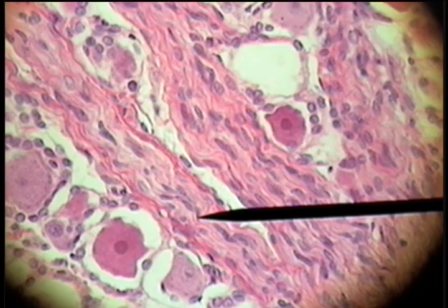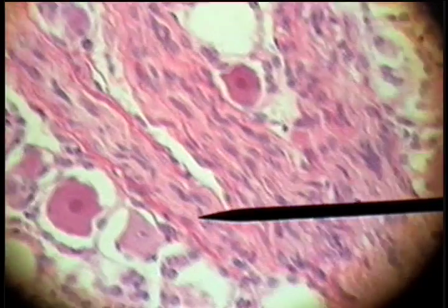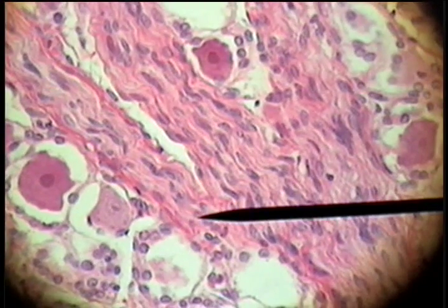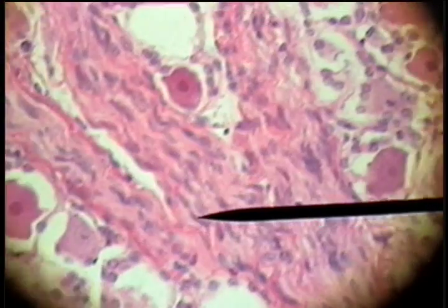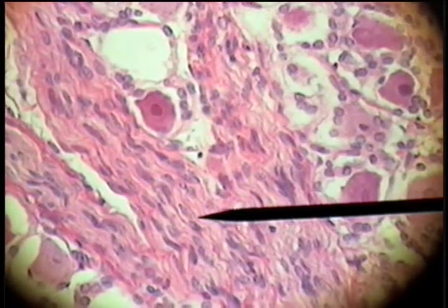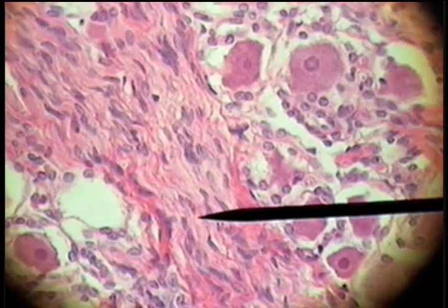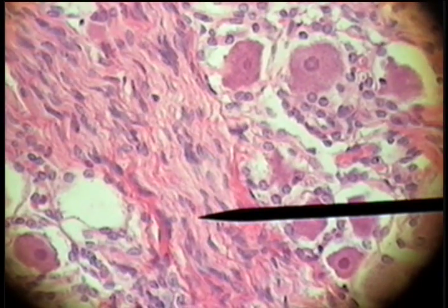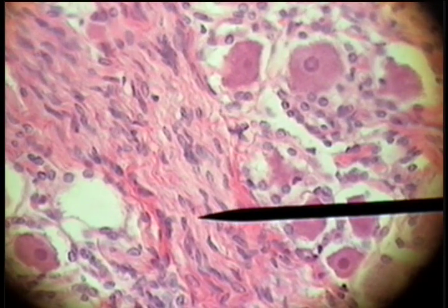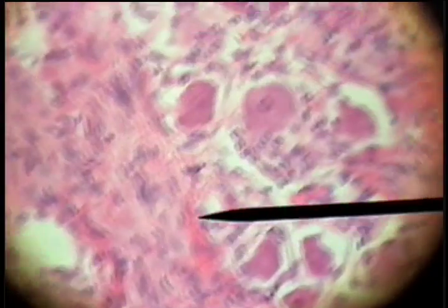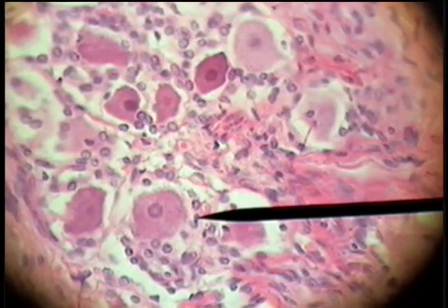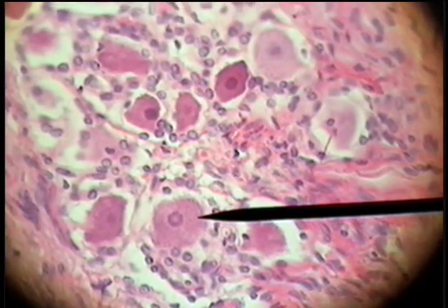The processes that enter and leave the dorsal root ganglia are these wavy longitudinal fibers. These are nerve fibers of the dorsal root ganglion coming and going from these owl eye cells.